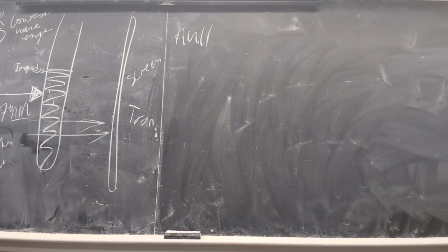So make sure you guys are dividing evenly, and each group, please appoint one member to come and pick 3 test tubes. Take a Kim wipe and 3 test tubes for each group.